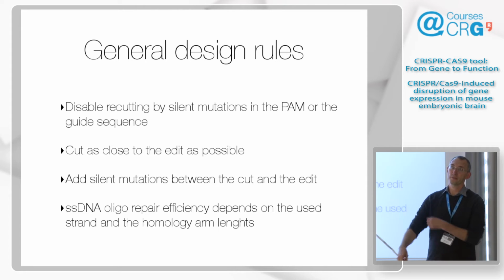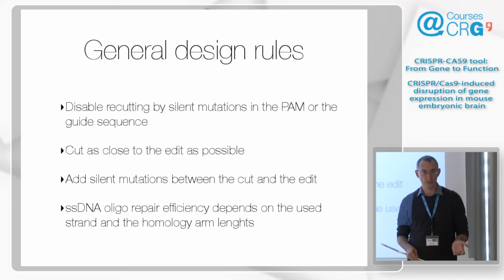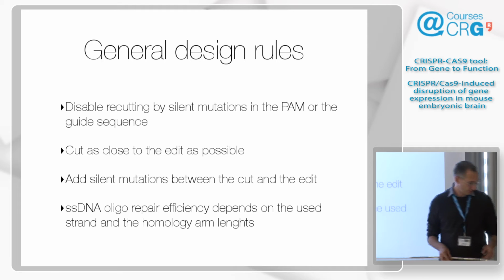I think the PAM mutation was favored because there's basically selection against it, right? But we could get both, and we also got the combination of the two, which is what we wanted. But when you change in between, that's treated by the repair as an insertion, and then you can only get both. And I think that's recommended.